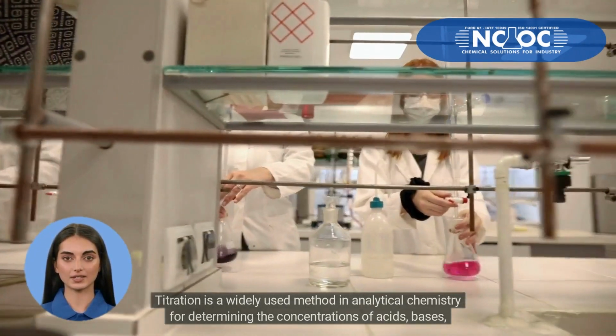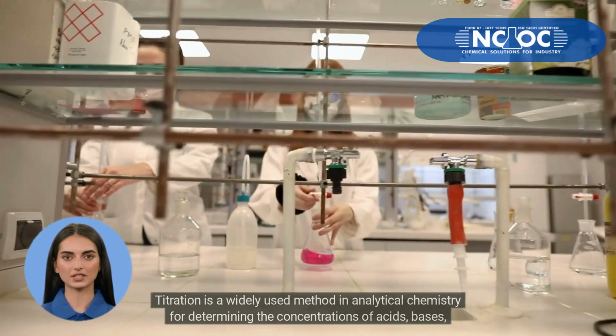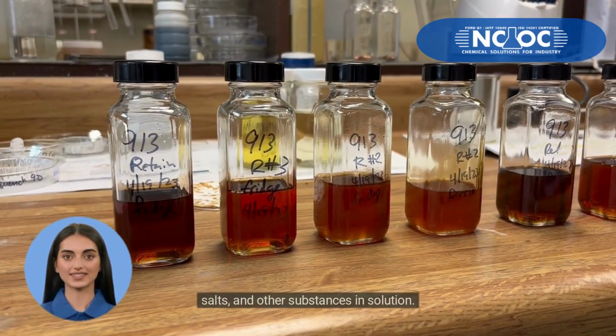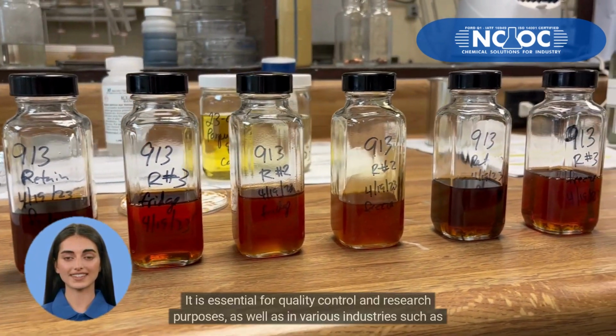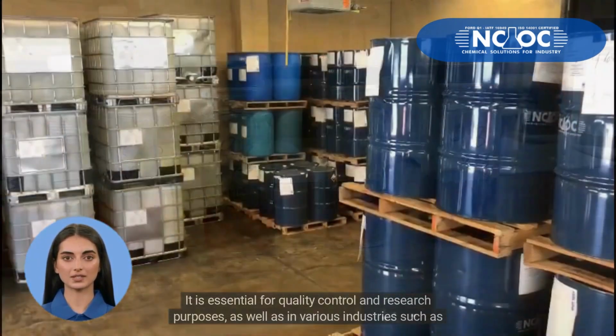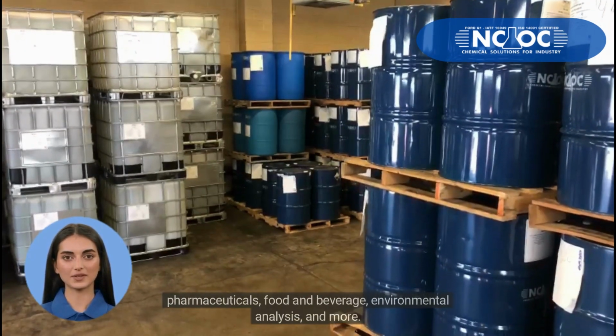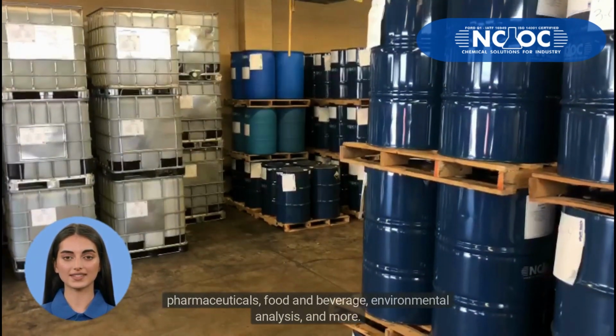Titration is a widely used method in analytical chemistry for determining the concentrations of acids, bases, salts, and other substances in solution. It is essential for quality control and research purposes, as well as in various industries such as pharmaceuticals, food and beverage, environmental analysis, and more.